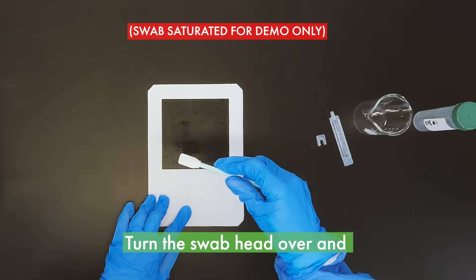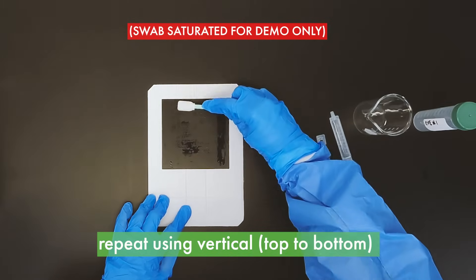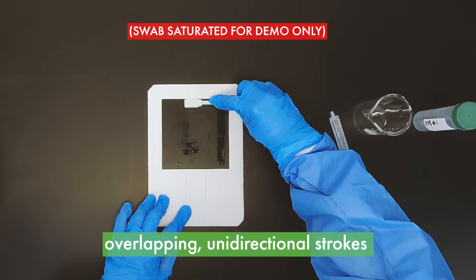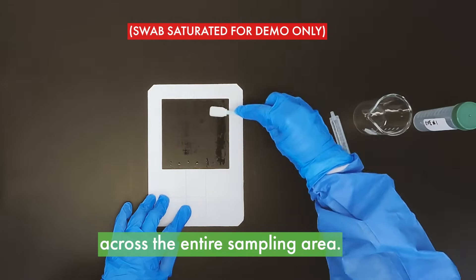Once the entire sampling surface has been covered, turn the swab head over and repeat using vertical top to bottom overlapping unidirectional strokes across the entire sampling surface area.